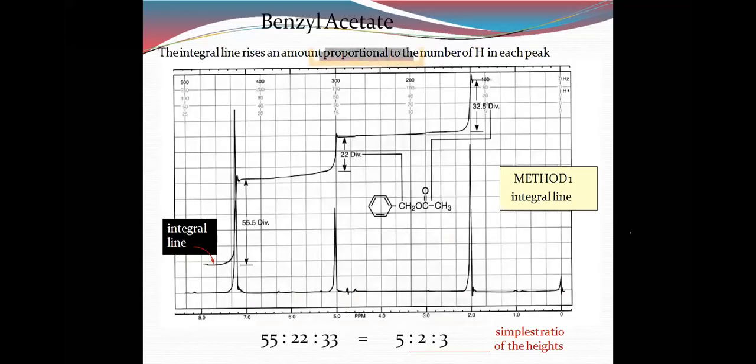So look here, students, this is an NMR spectrum. Start from here, chemical shift will be 0, sorry, delta will be 0 for the TMS. Now deshielding takes place. So in this compound, first let me know how many types of protons there are, how many types of peaks should be there. Sir, 3. Very good. We have seen this compound previously.